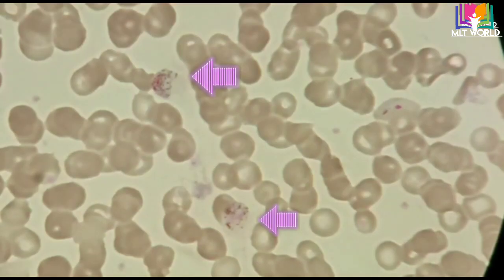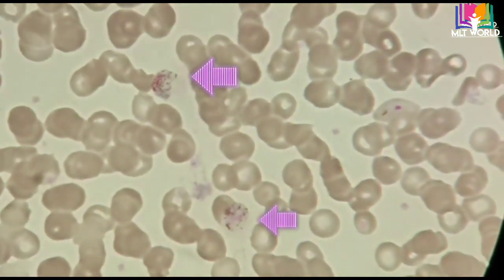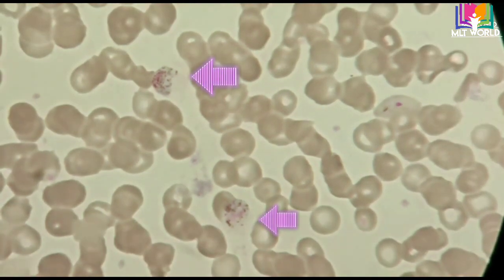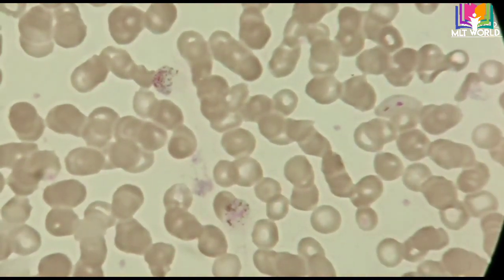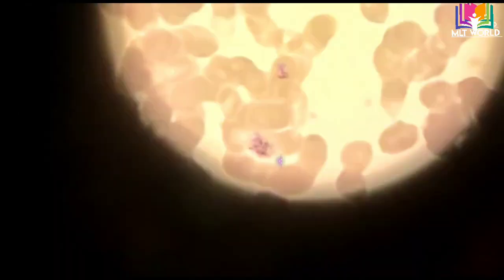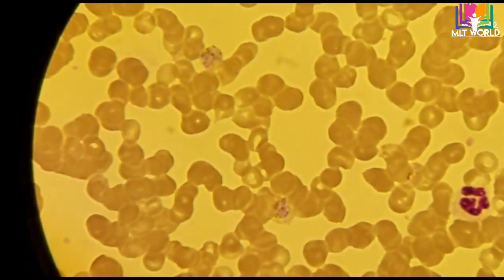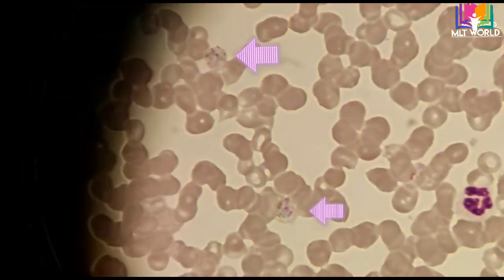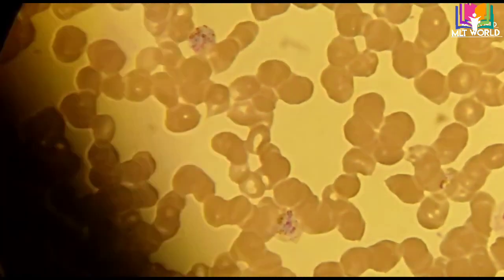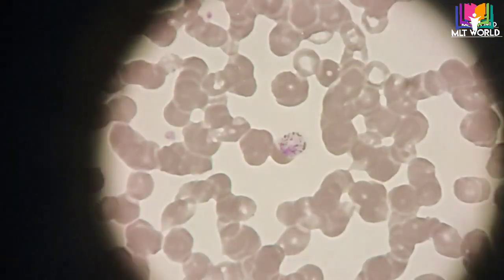Now this is the thin smear. In the thin smear there are malarial parasites, RBCs, platelets, and WBCs — that is the difference between thick and thin smear. When we do not fix the thick smear, all RBCs will lyse and wash away, but WBCs and malarial parasites will not lyse. So it is easy to read malarial parasites in the thick smear. The purpose of the thick smear is specifically to find malarial parasites. For a blood film study we need only the thin smear.